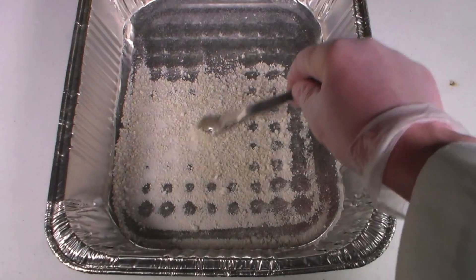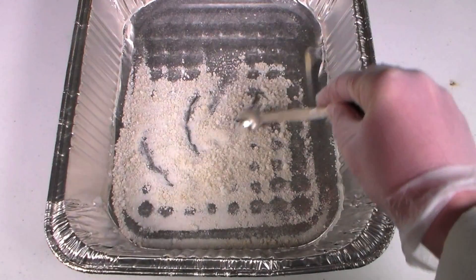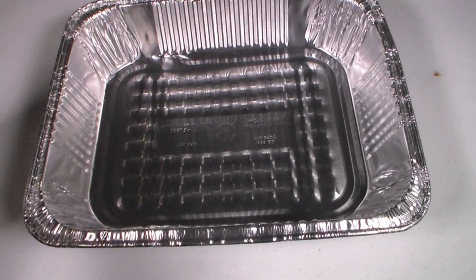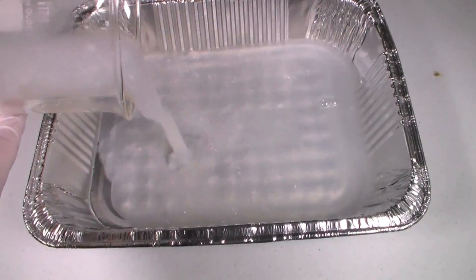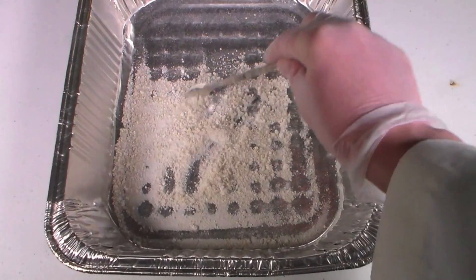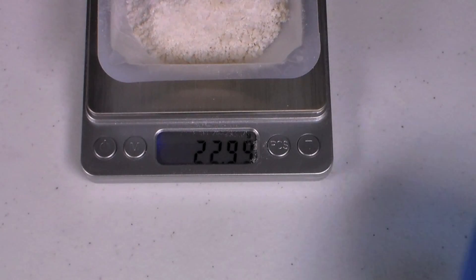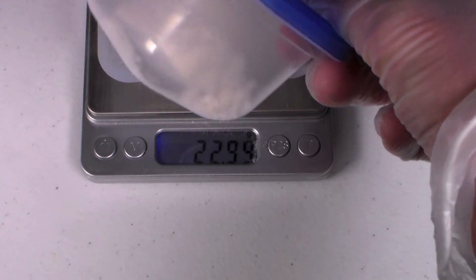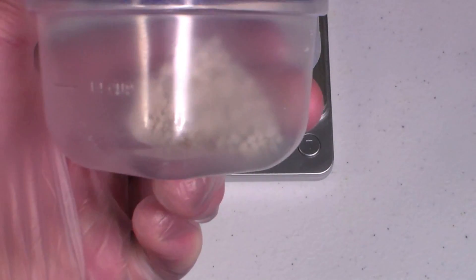Since the theoretical yield of aluminum oxide is only 10 grams, something went wrong. Either this is a hydrated form of aluminum oxide, meaning it contains water, or it is extremely impure. Either way, it probably won't work very well for the dehydration of ethanol. Fortunately, I have already tested the 5 gram sample of aluminum oxide and confirmed that it works for the dehydration of ethanol.